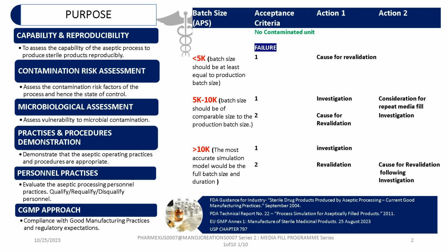Now all this database and detailing across this slide has been covered under the FDA guidance for industry, that is Sterile Drug Products Produced by Aseptic Processing, Current Good Manufacturing Practices of September 2004, PDA Technical Report 22, Process Simulation of Aseptically Filled Products 2011, EU GMP Annex 1, which was lately revised on 25th August 2023, on manufacturing of sterile medicinal products, and USP Chapter 797, which covers all the detailing on the media fill aseptic techniques.